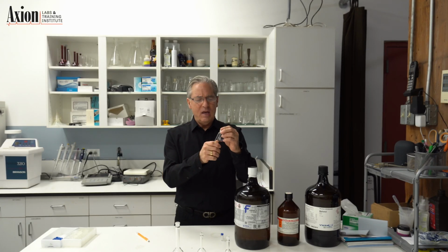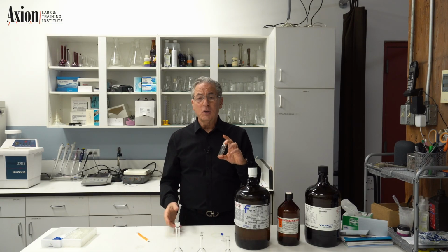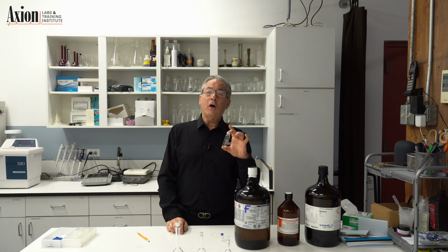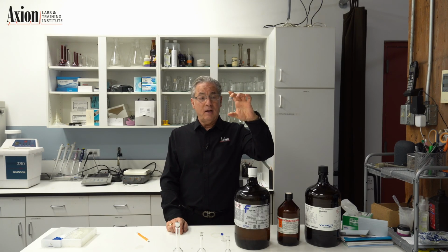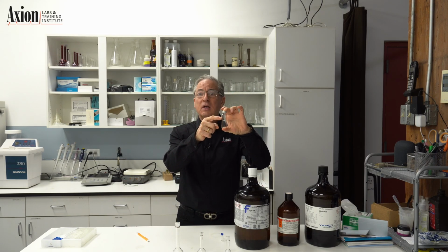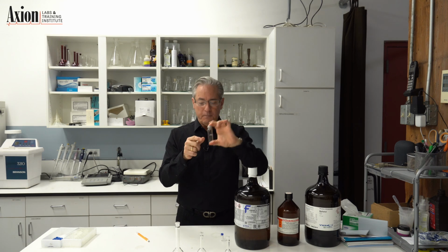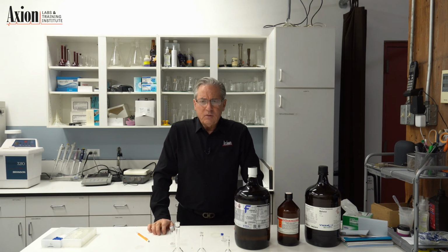So Headspace is big for looking at residual solvents in pharmaceuticals, also big for looking at alcohol in blood, because blood, again, is a pretty messy sample. You don't want to inject it on a GC, but I could put a couple of drops of blood in the bottom of this vial, and then I can measure any volatile components, such as ethanol, in the vial. So that takes you through some pretty good looks at sample prep for GC.